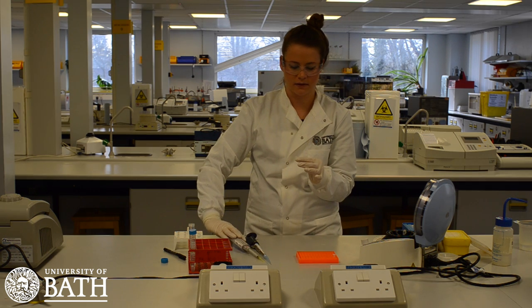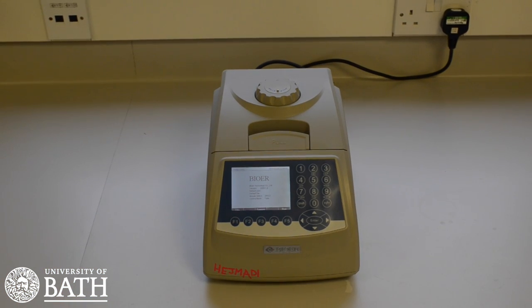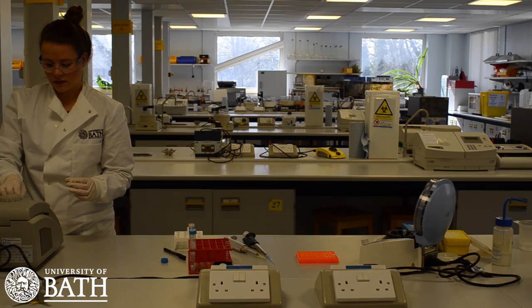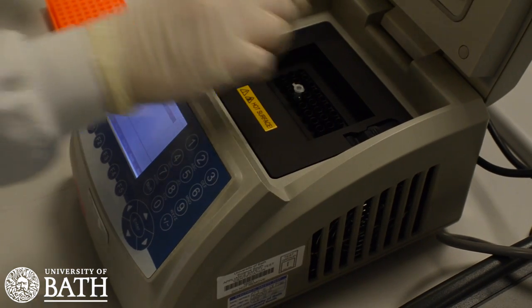Your DNA samples are now ready for the PCR process. A PCR cycler will be used to run the PCR process on your DNA samples and multiply the specific DNA fragment of interest. Place the PCR tube into the PCR cycler and close the lid.